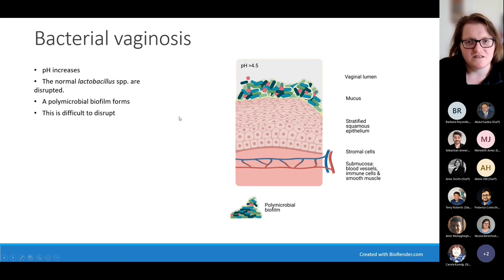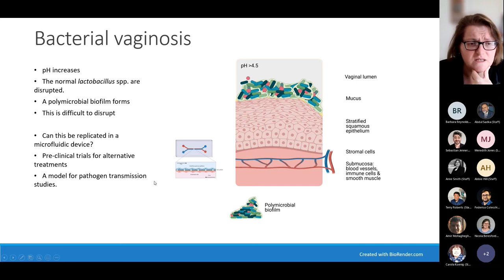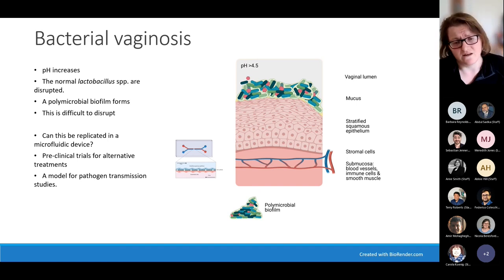We've got to the stage in terms of this working with Ashley, so we're at the lactobacillus stage. We've also started working quite recently with Ronan McCarthy, who does similar work in terms of the microbiome. So I think he'll come on board, and he has clinical isolates in terms of gonorrhea to work further with this. And he's looking at some treatments as well for bacterial vaginosis that we'll be able to test within the device. And then the other thing that we can look at is whether or not we get higher transmission of things like STIs across the tissue that's been formed, because that's one thing that we find is that you get higher transmission of STIs, especially things like HIV, which is a big problem, obviously, if you're in places like sub-Saharan Africa, and there's a high prevalence of BV, there's a high prevalence of HIV, and then you're getting a higher transmission rate of HIV.